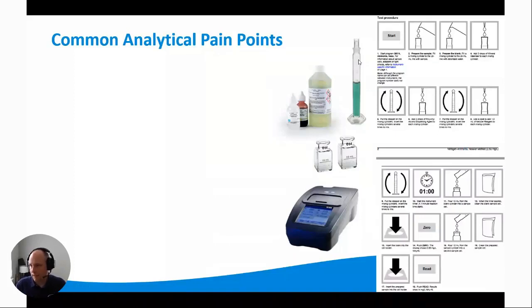I will point out that this reagent here, this tall bottle, is Nessler's reagent, which is 5 to 10% mercuric iodide. So it contains mercury, which is obviously not a healthy reagent to be dealing with, either for humans or for the environment. But that is part of the traditional approved method.